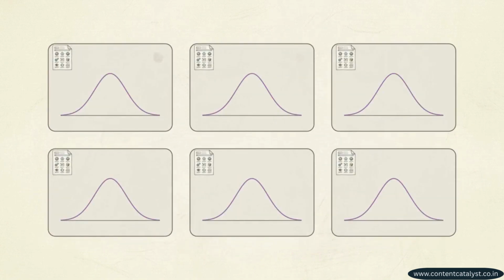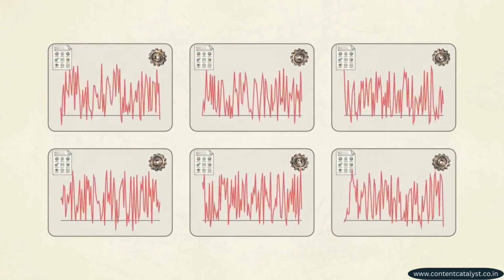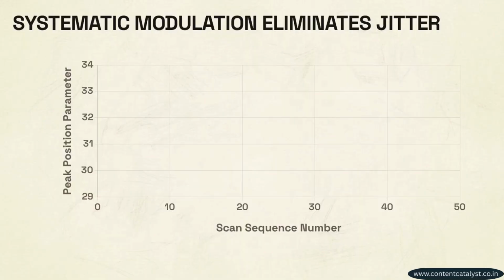The standard approach to this time series data is fitting each sequential scan independently, but treating each time step as an isolated universe introduces random mathematical noise, obscuring the actual physical trend. Profex 5.7.1 tackles this dataset problem by allowing the linear modulation of coupled variables.